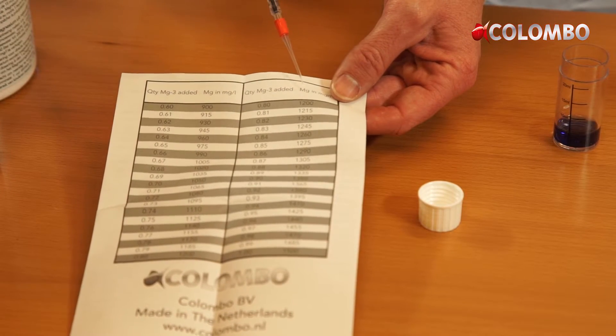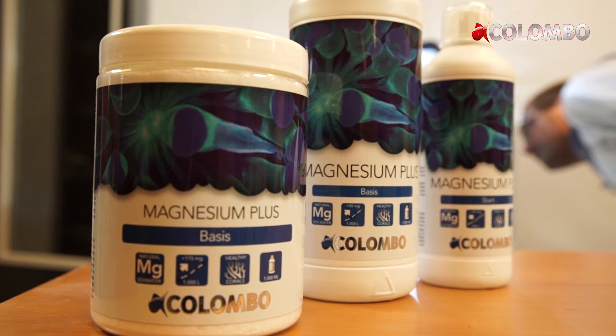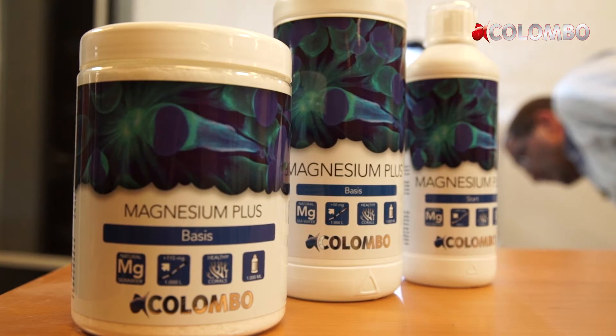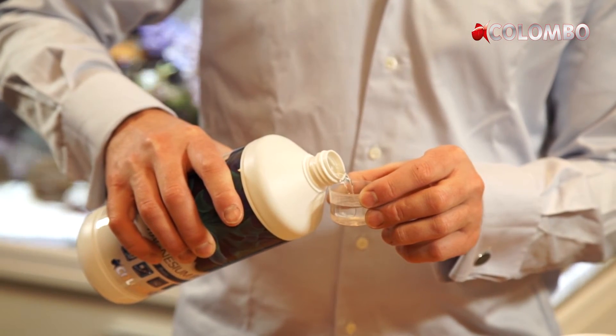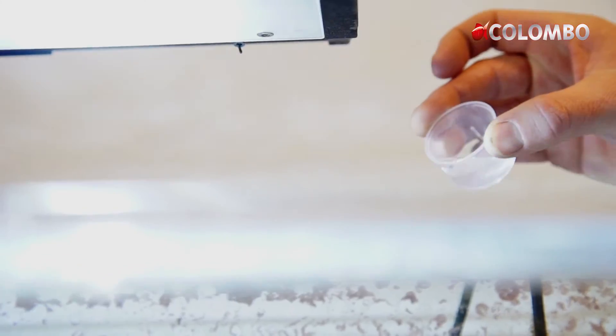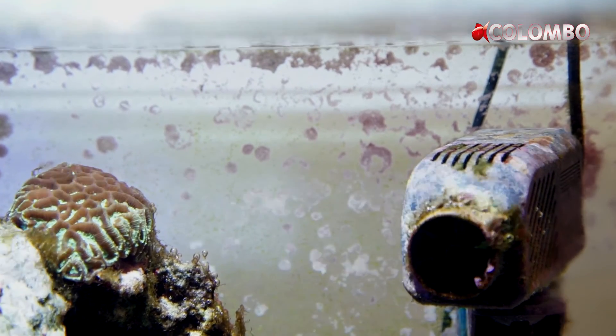We recommend testing the magnesium volume once a week. This way you can work out how much magnesium plus you have to add to maintain the magnesium level at the desired level. Divide the quantity of magnesium plus needed by 7 and add this daily. Based on your weekly measurement you can increase or decrease the dosage when needed.